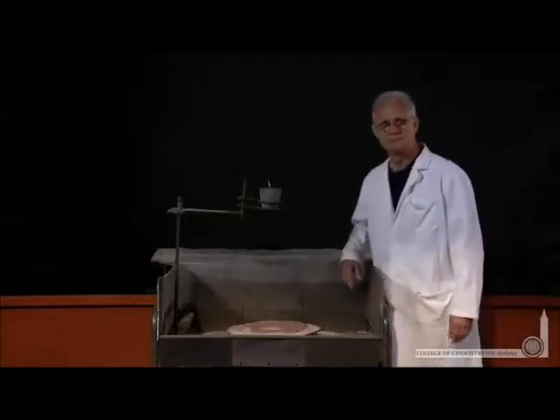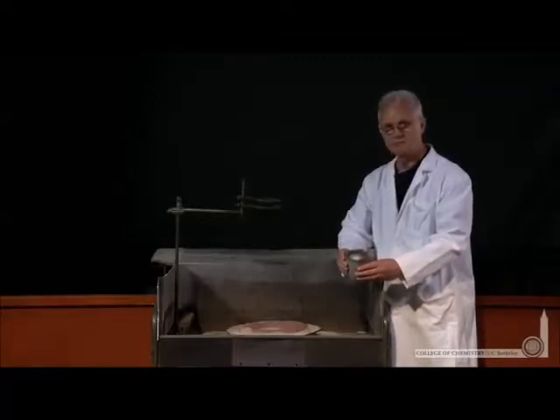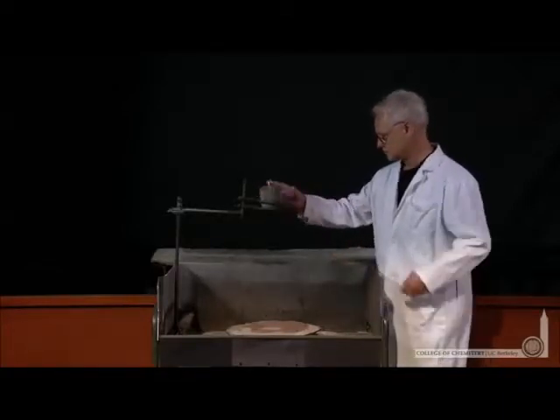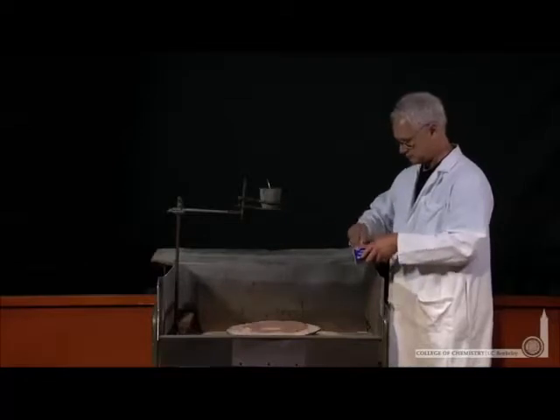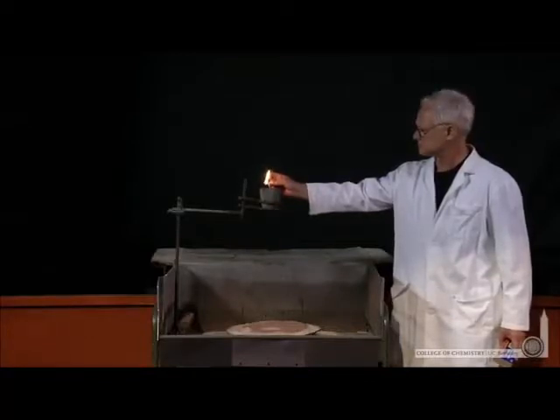So we're in the demo lab with Lonnie, who's prepared iron oxide and aluminum together so we can see that reaction. Now, this reaction is actually the reaction that was responsible for the Hindenburg disaster. The German dirigible was painted with aluminum paint over an iron superstructure that had iron oxide rust on it. And the reaction between the two is what caused that dirigible to flame and melt. The iron actually melted. Let's see if we can see that happen in our experiment.